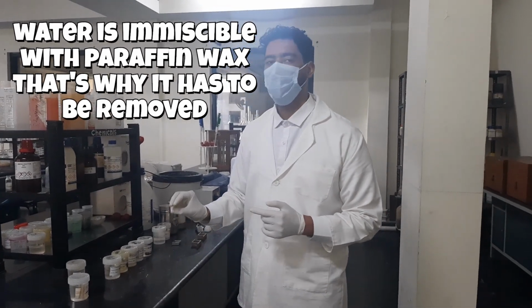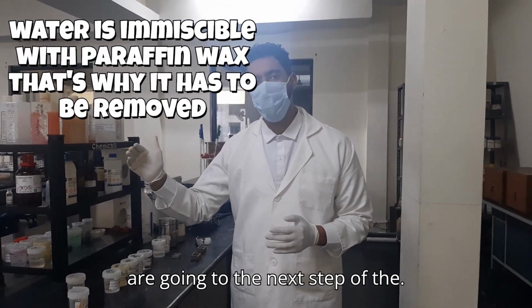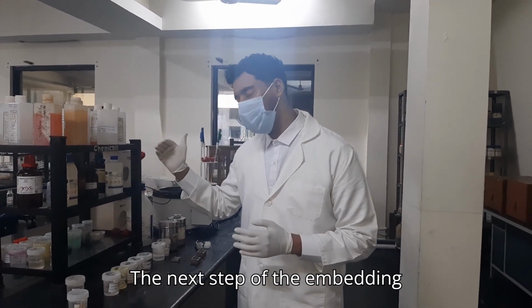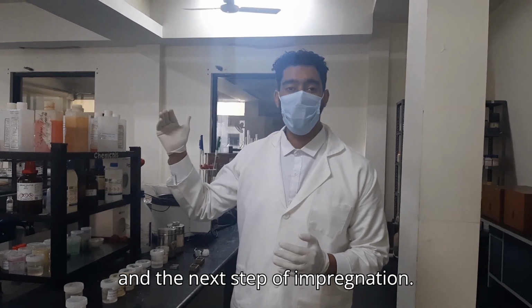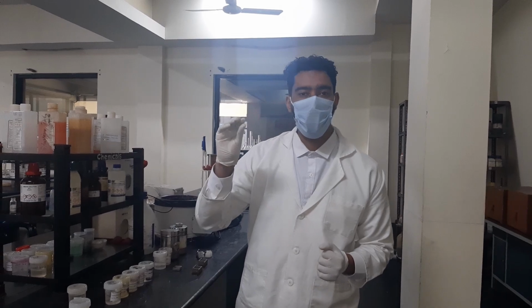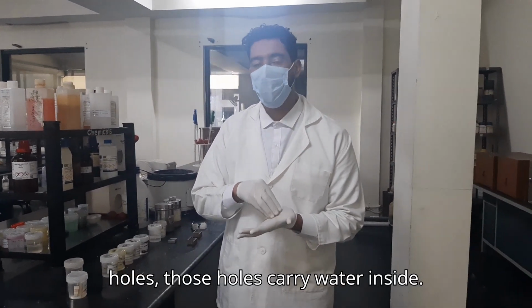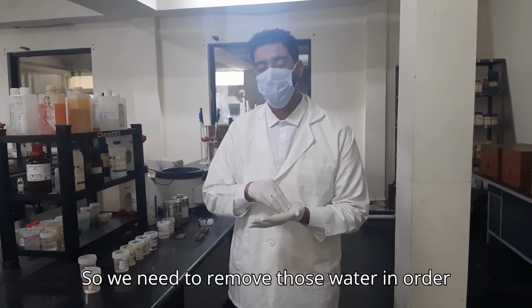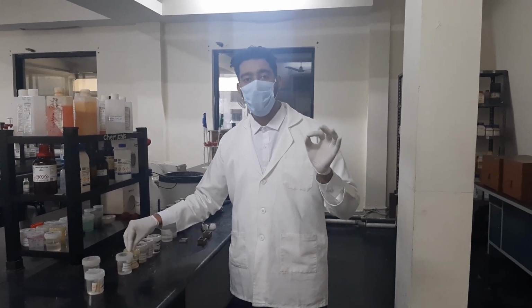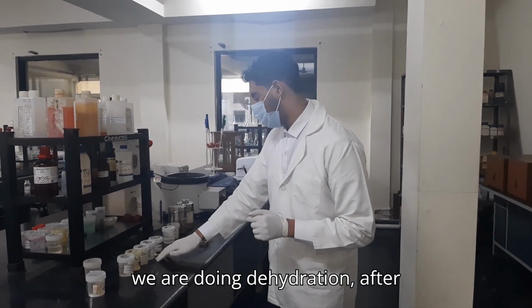Water in the tissue will be removed because in the next steps, embedding and impregnation, the tissue has special holes inside that carry water. We need to remove that water to make the holes empty, with no water inside. For that reason we are doing dehydration.